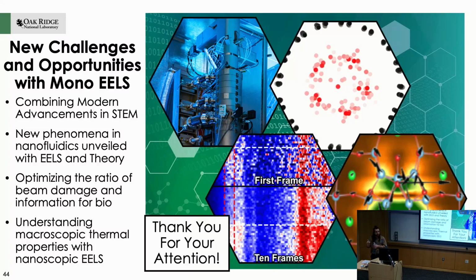One of the really cool things about the way we do this is that because it's all done at ultra-high vacuum, 10 to the minus 9, you don't actually get the same ice buildup on your samples that you do in lower vacuum microscopes. On traditional TEMs, if you do cryo experiments, a small layer of ice builds up as a function of time that really starts to hurt your results. But we don't get that. We can do really long acquisitions with no ice buildup. And we can directly measure that we don't get any ice buildup because we can access the ice vibrational modes.